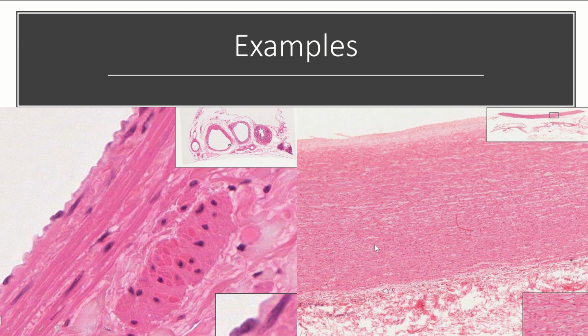And then this is a zoom in on the aorta. This one is a really big vein. I think this is the hepatic vein, so it's one of the biggest veins in your body. You can see this is the inside of the vein, and here you can see there's that tunica media. So there is some smooth muscle here, right? There is some smooth muscle here.